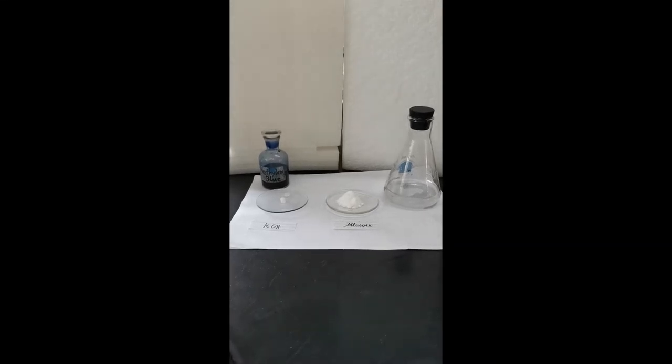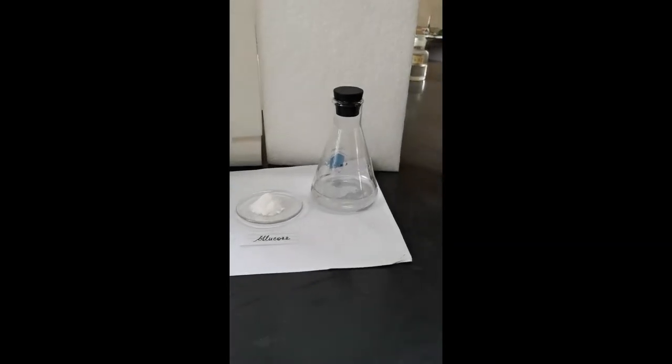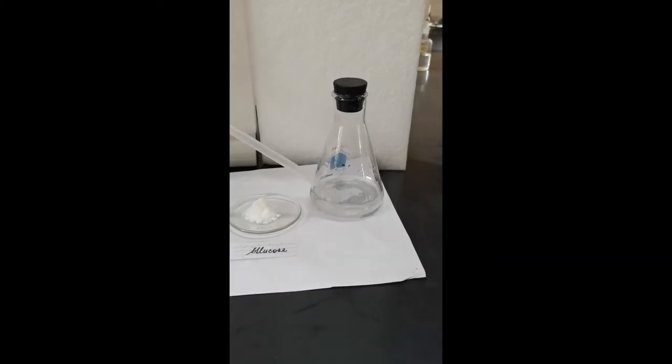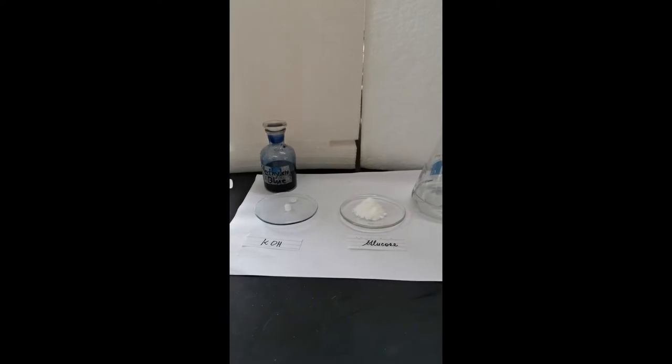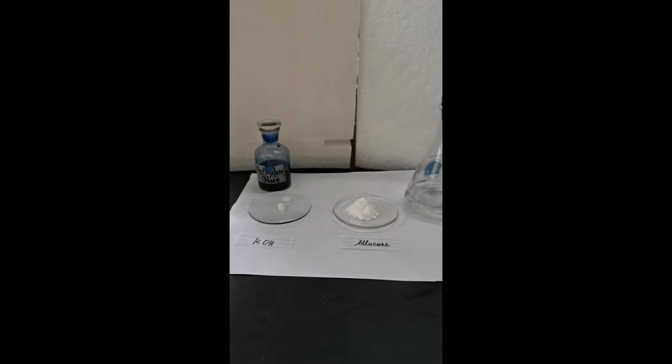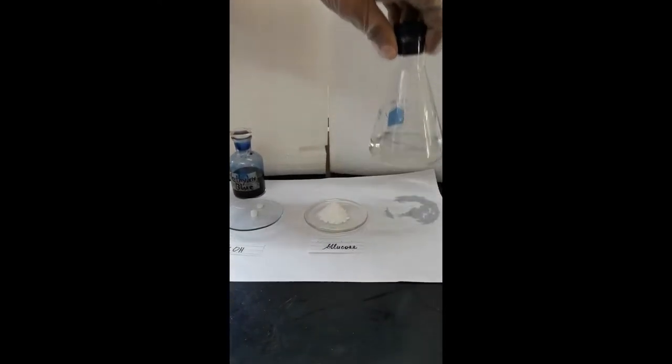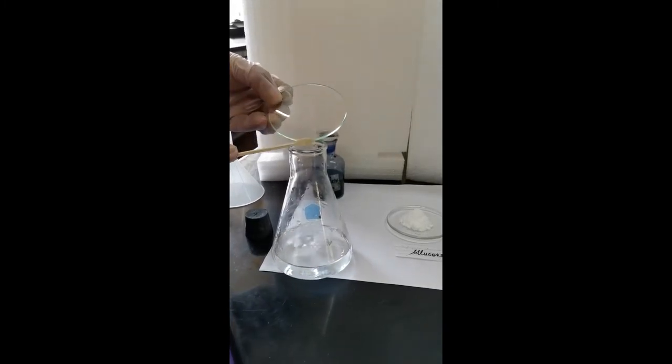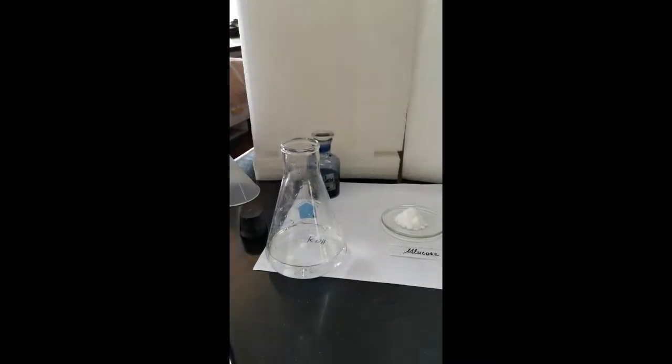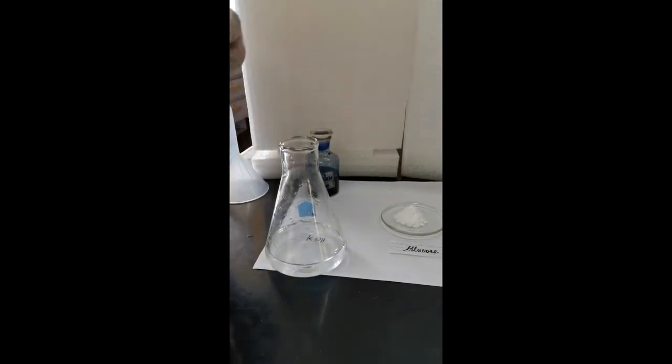In a 250 ml Erlenmeyer flask, place 75 ml of distilled water and then add 2 grams of potassium hydroxide pellets. Stir and swirl to dissolve the potassium hydroxide.